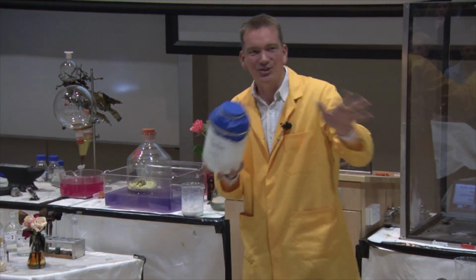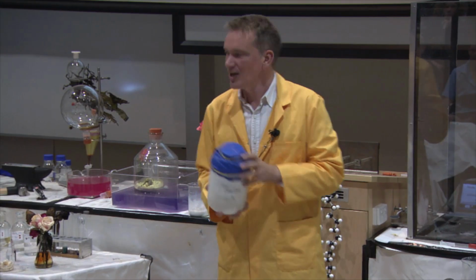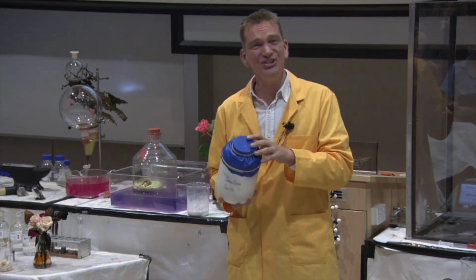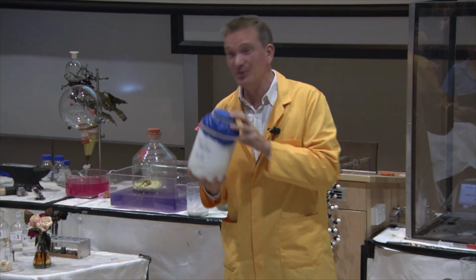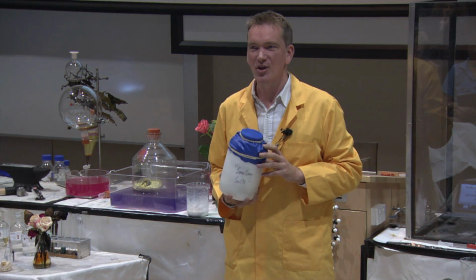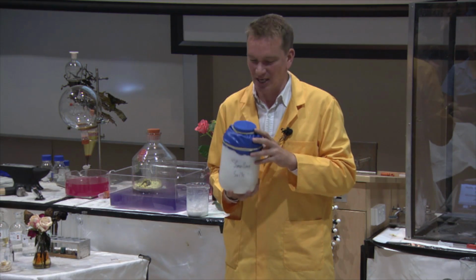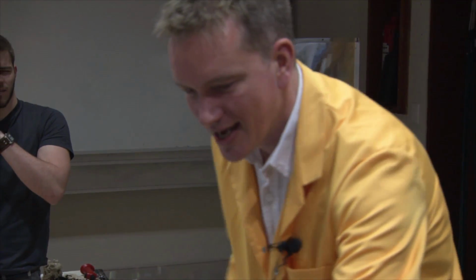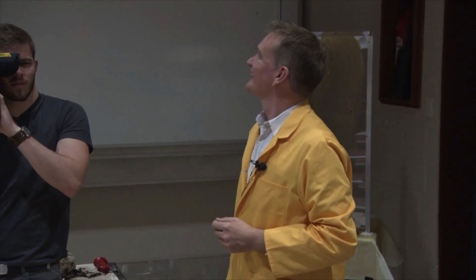All you need to do, I'd like you to experience this for yourselves, okay? You just need to hold this very carefully and then just push down on the rubber, and there's a little hole there, and you'll get a whiff of ammonia, okay? So you can smell what ammonia is like, okay? So we'll pass this, I'll pass this over here. So here, if you'd like to try this first of all. So just take the whole thing, and just cautiously push down and smell, and see if you can smell it.